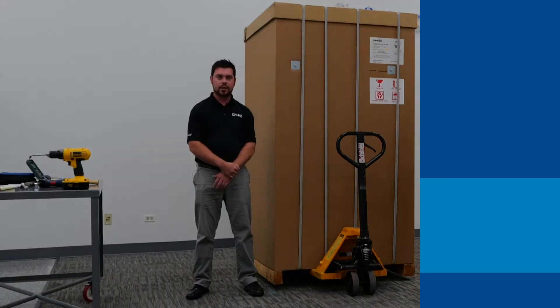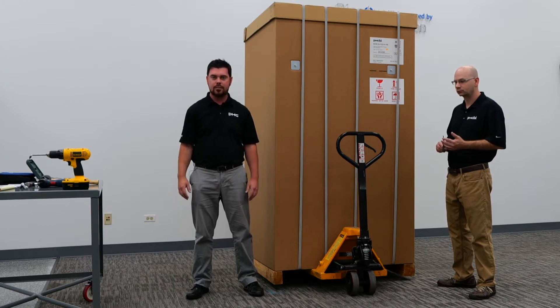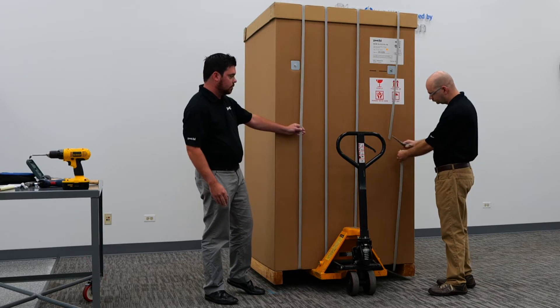Hello, today we're going to be walking through the steps to uncrate a new minus-80 upright PHCBI freezer. First, we'll begin by stripping off the packing straps.